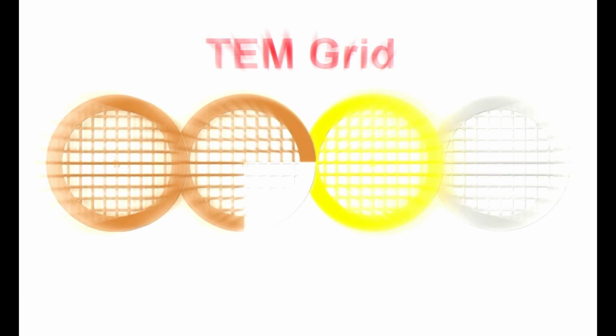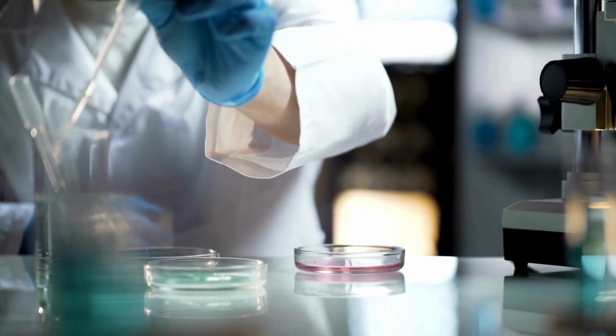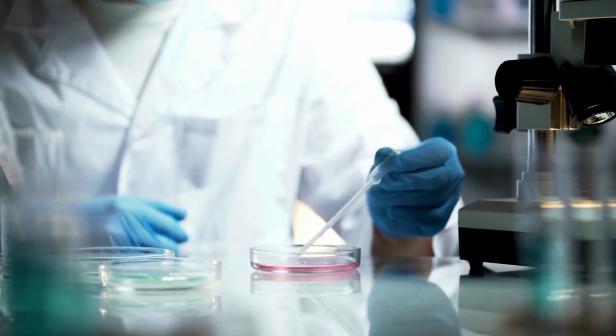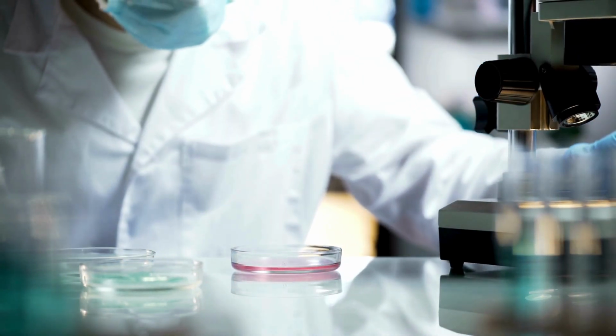Which TEM grid should I choose? Lacey, Holey, or a Formvar carbon film? This is a fundamental question that often arises during sample preparation. In this video, we will address this topic to help you make the right selection.